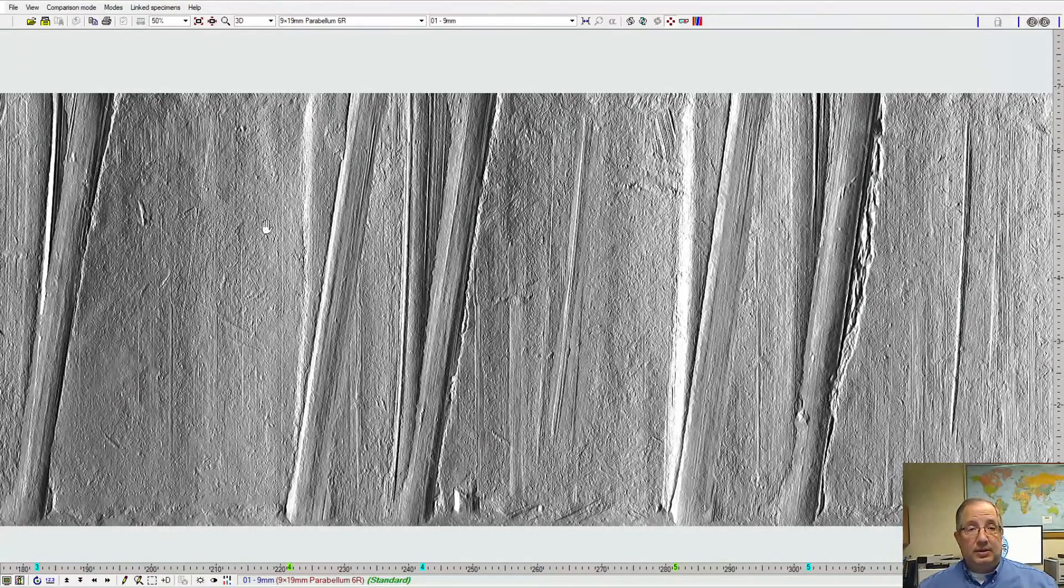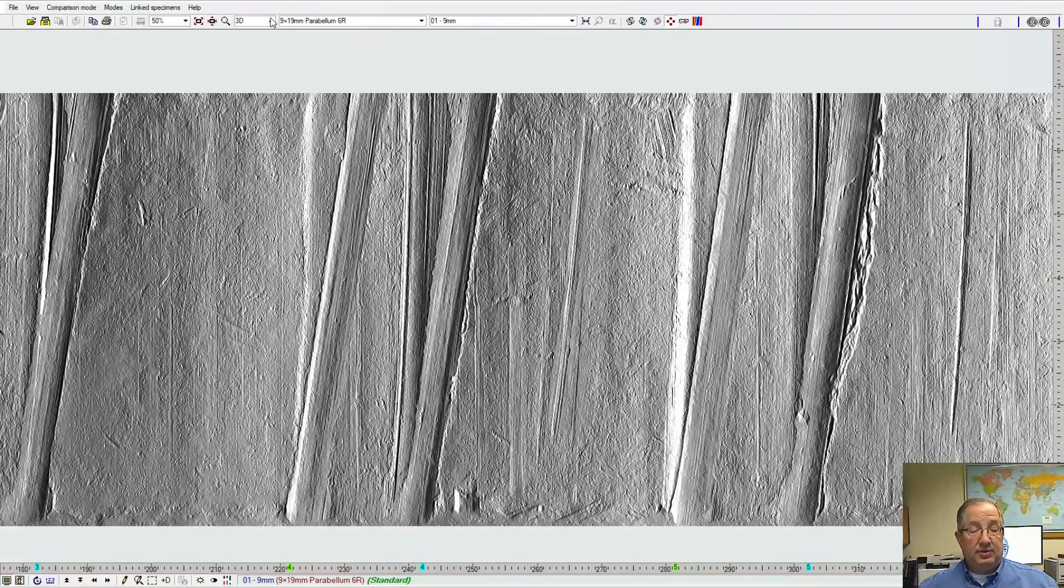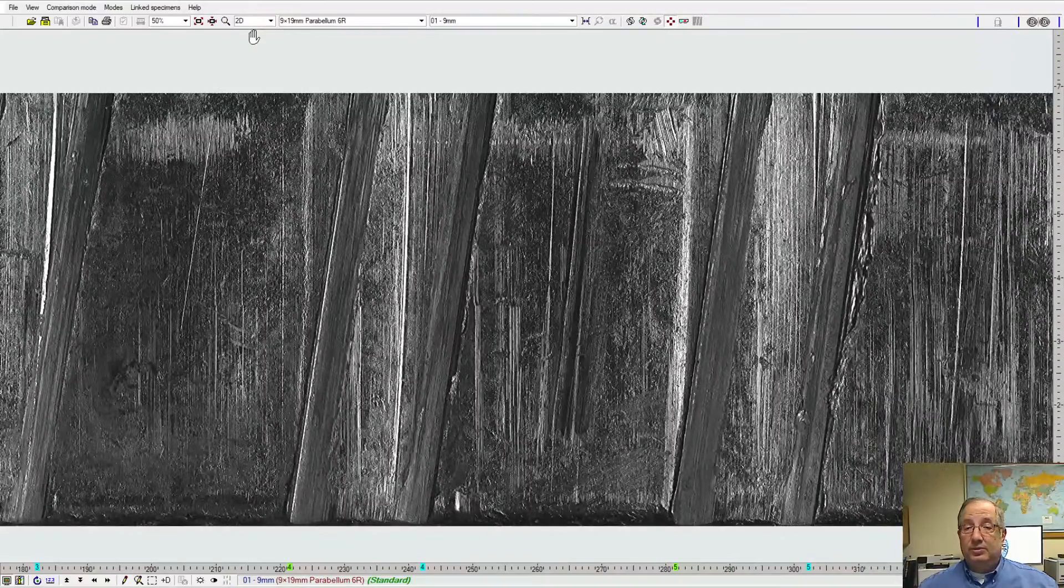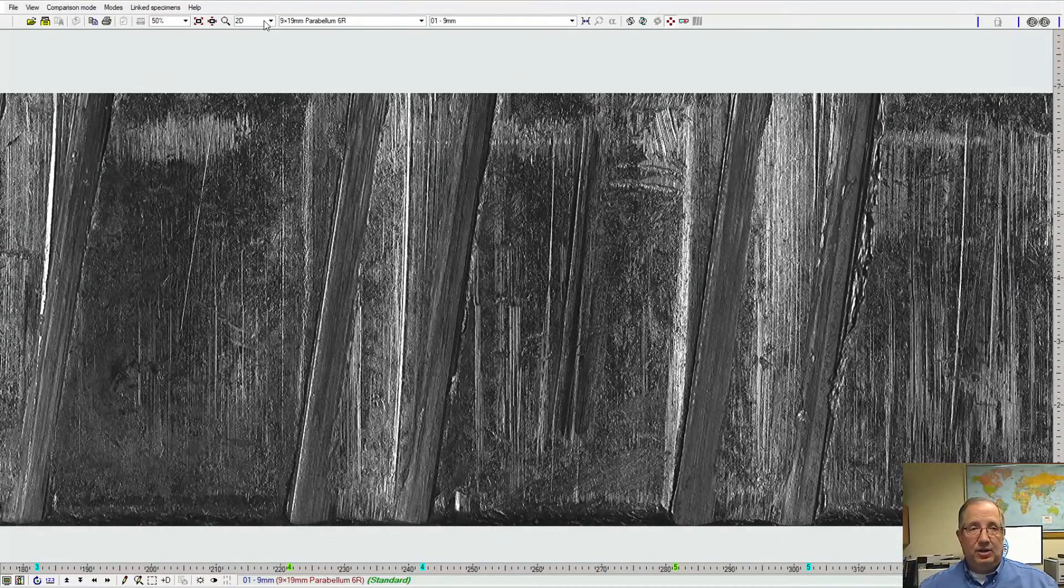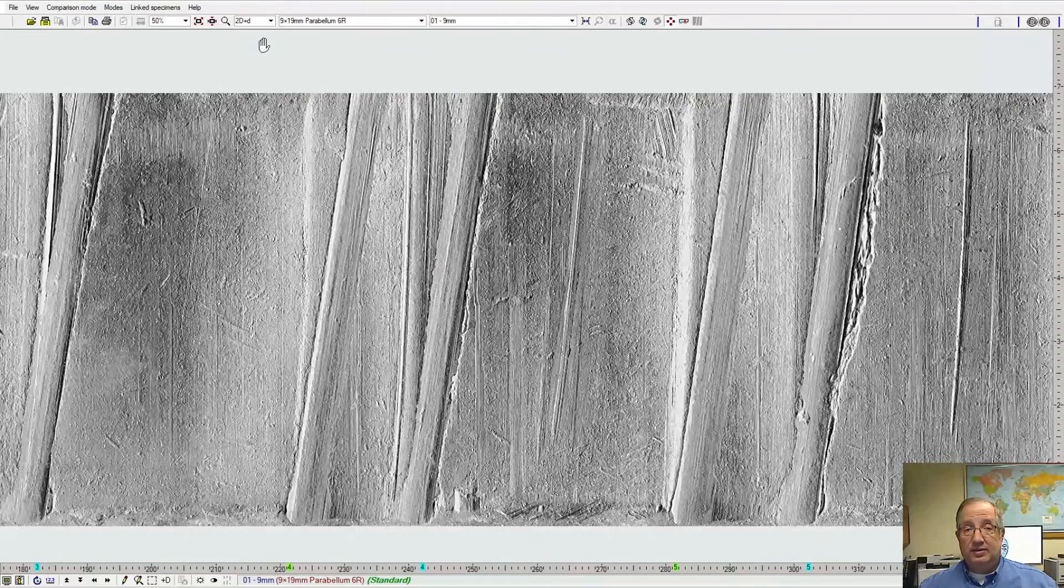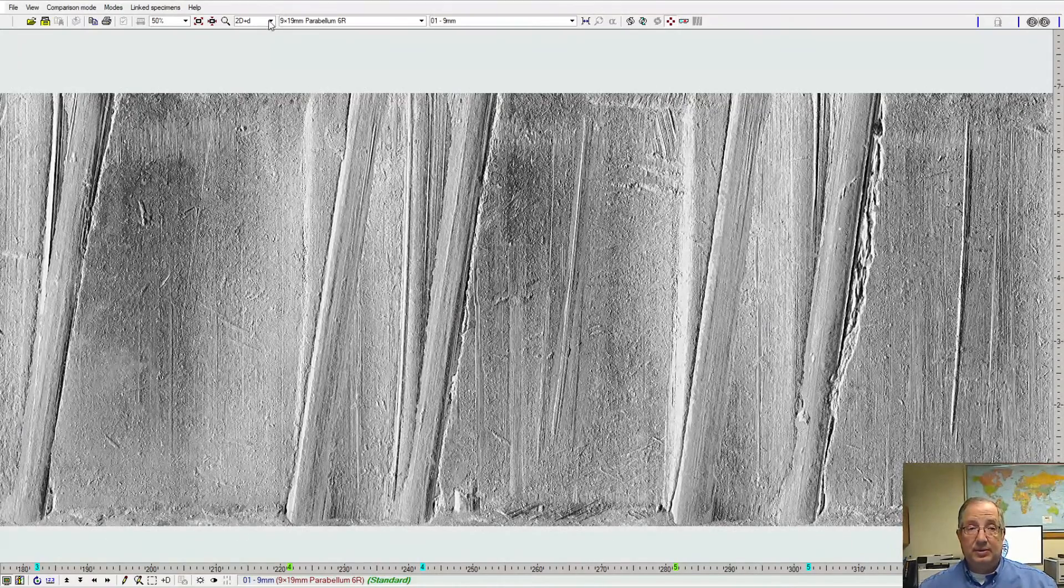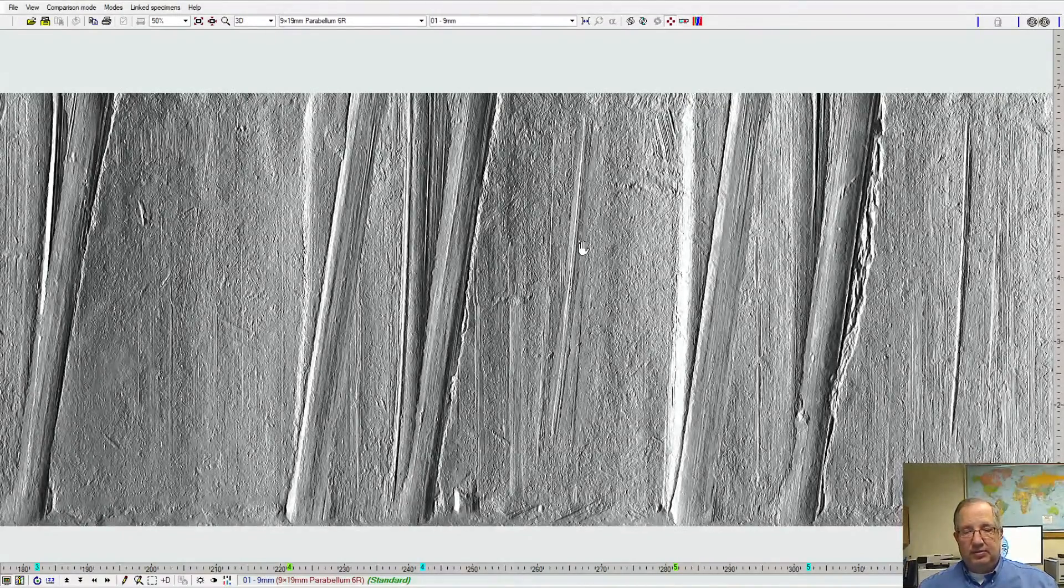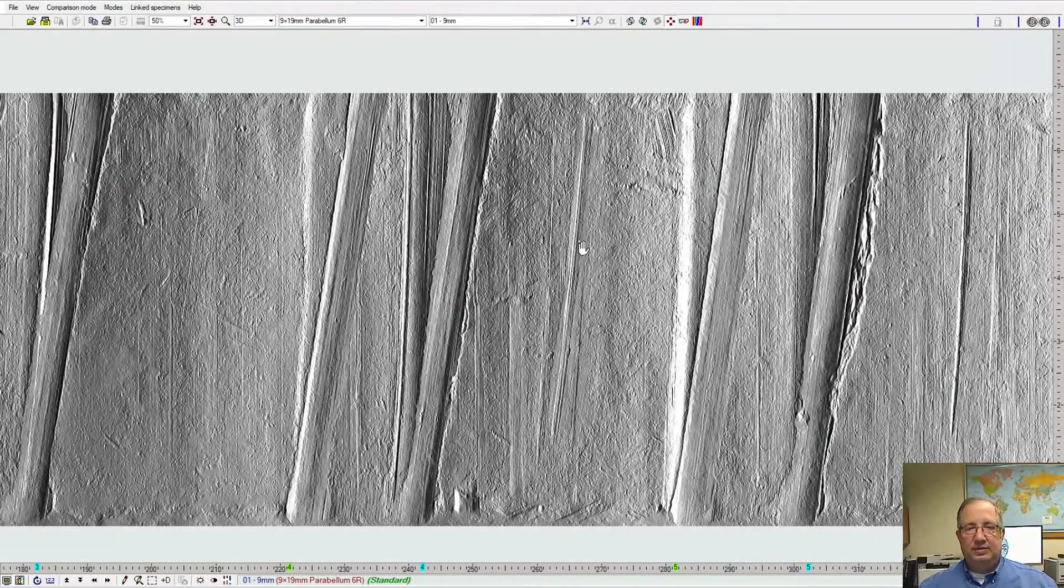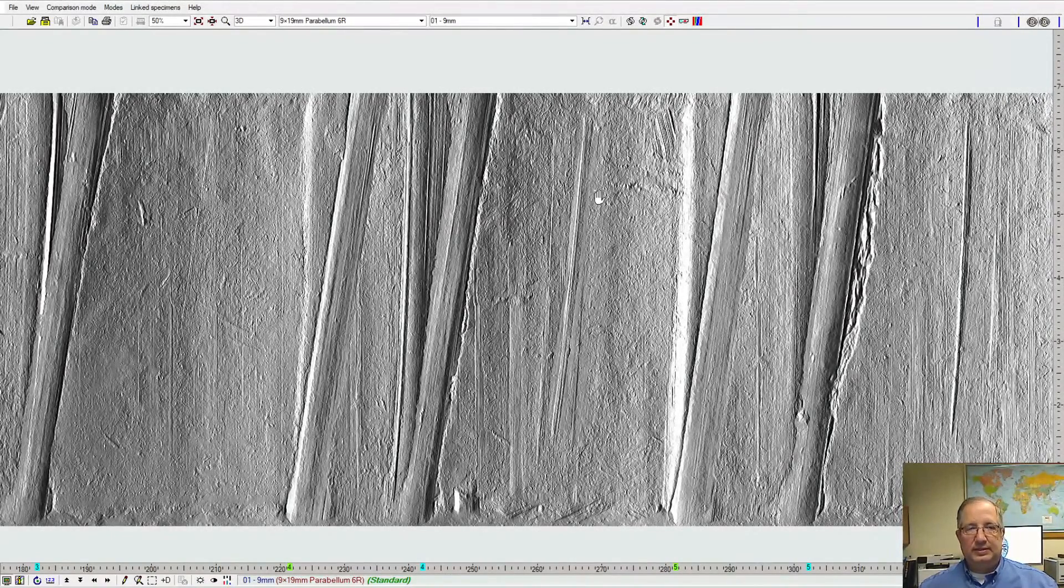Just like we saw with the cartridge cases, we can also change the mode of viewing. Right now we're doing a 3D view of the sample. Using this control we can go to a 2D view, so it's a grayscale flat image, or we can overlay that 2D image on top of the 3D model for the third contrast method, the 2D plus D mode. And all three of these are available for all of our viewing preferences for both bullets and cartridge cases.